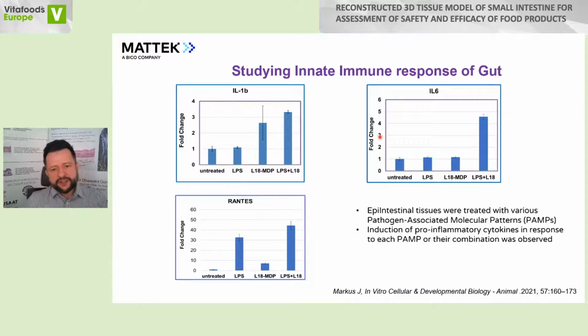As a spin-off of this experiment, we were also interested if our epithelial model is able to react to the presence of pathogens by innate immunity reactions.